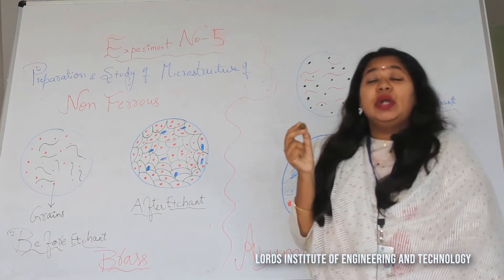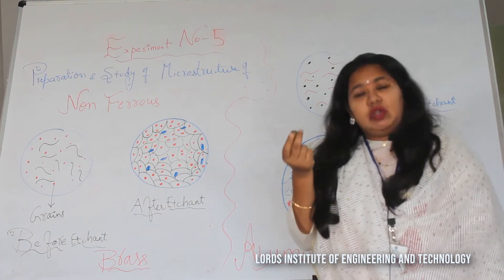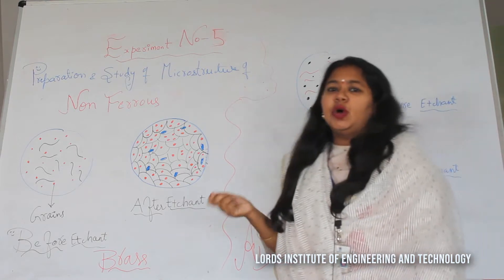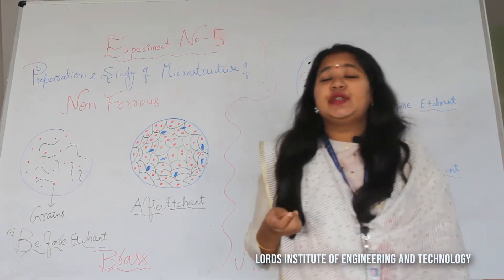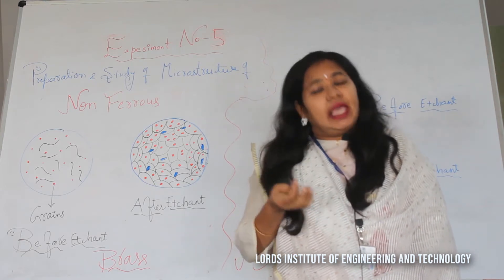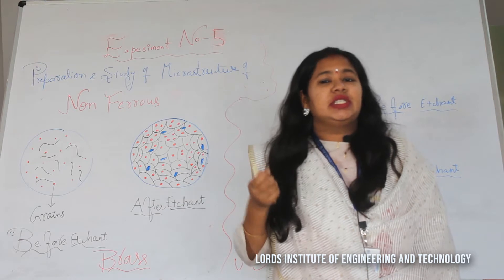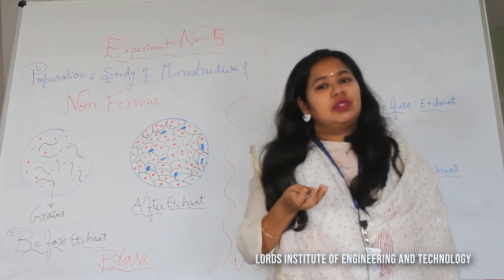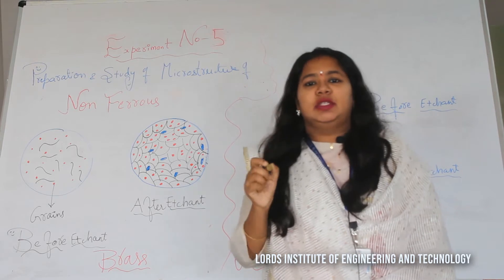Brass is one of the oldest ancient materials, and we normally use it for utensil purposes. Now let us go for the grinding operation, then disc polishing, then using emery papers, then etchants, and finally we will view the microstructure of this brass specimen under the microscope.